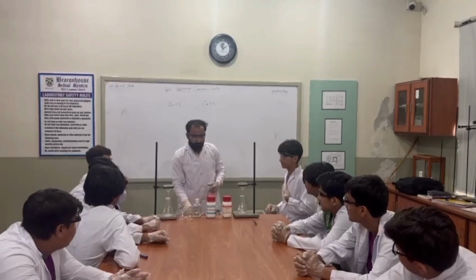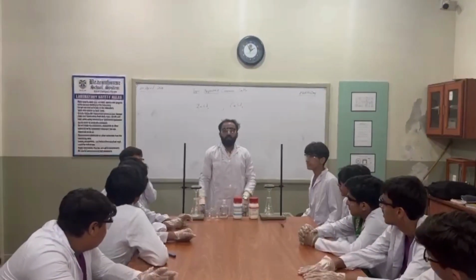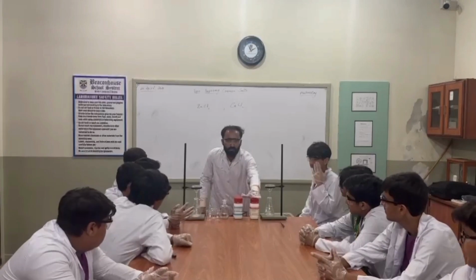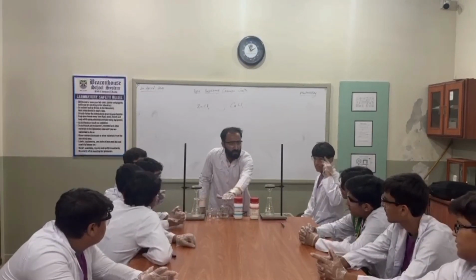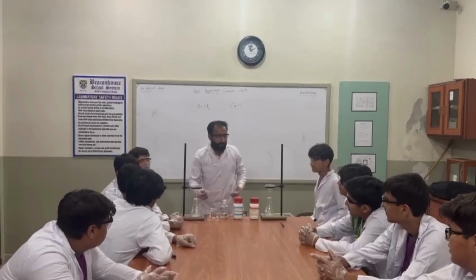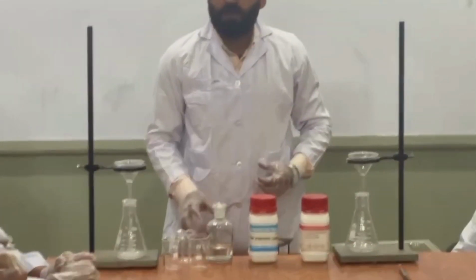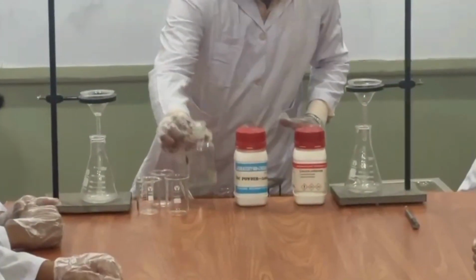Okay, dear students, welcome to the lab. Now, what we have studied, we will perform here for the formation of salts. We have calcium carbonate here, we have zinc metal here, we have hydrochloric acid, HCl, we have some beakers and filtering apparatus, and a Bunsen burner along with some gloves and all that we need for the preparation of the salts. Okay, let's start our experiment without any delay.